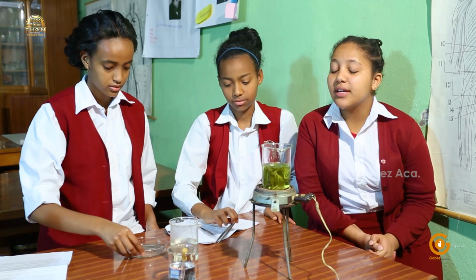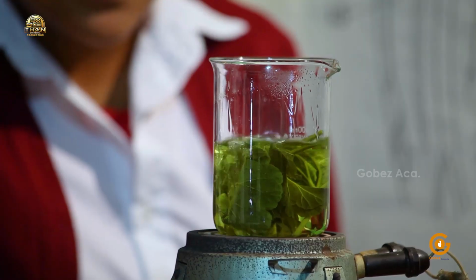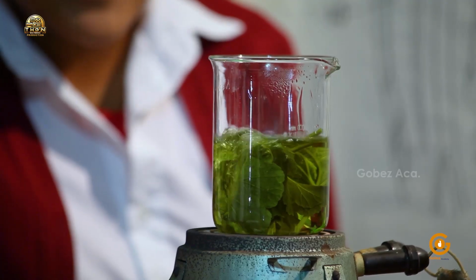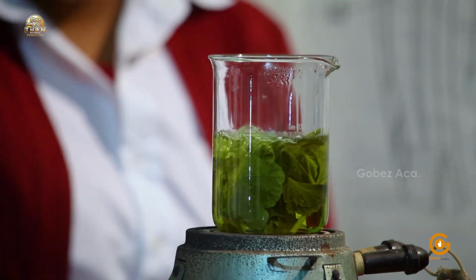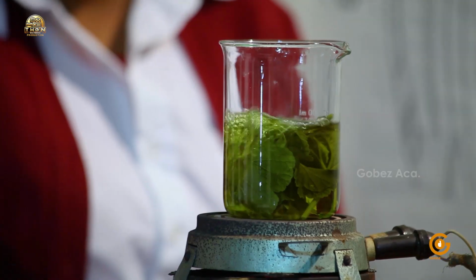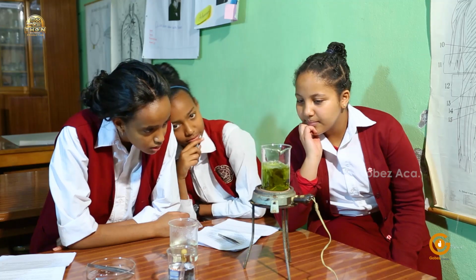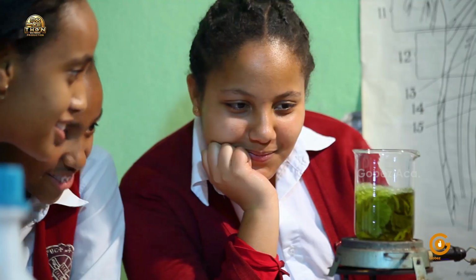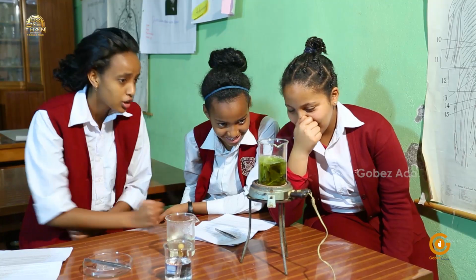Now let's wait until the green color is completely removed. We can see that the water is changing into green. It's actually the ethanol. Yes. I'm sorry, the ethanol. Is it changing colors? Yes.